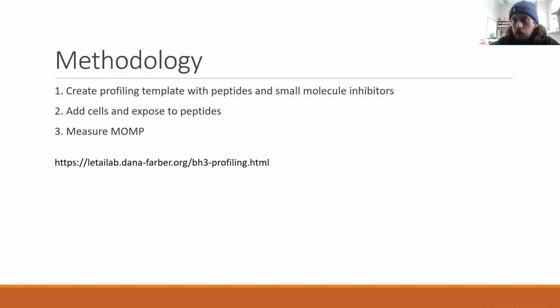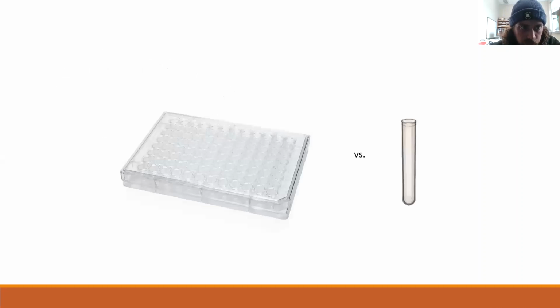I've included the link to the Letai lab. They actually have a whole section on their website basically detailing this entire protocol. They have an appendix with all the buffers and everything you need. So if you really are interested in trying a BH3 profile, I would recommend first going to their lab and just looking at the documentation they have.